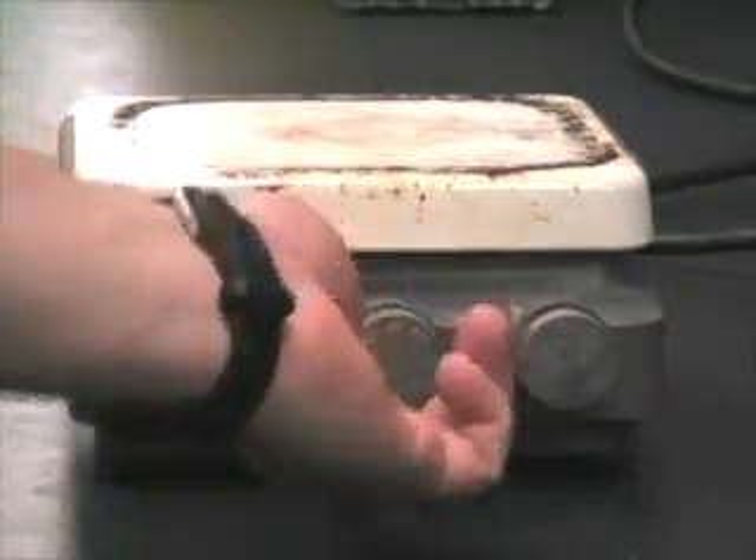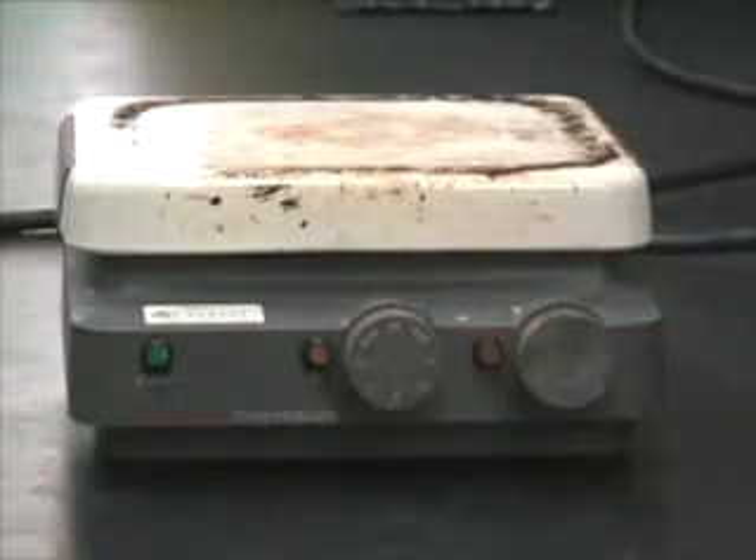The heating element is on the right-hand side. Notice how the element flashes when the maximum temperature has not been obtained.